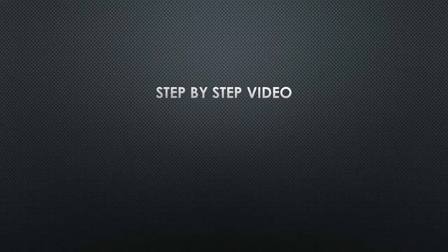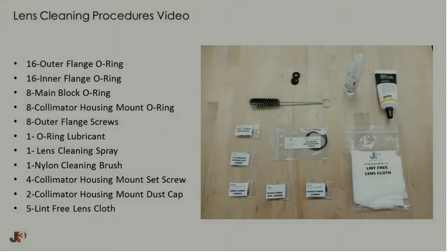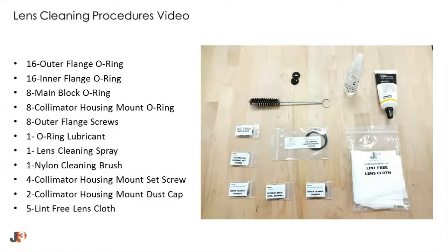Let's take a closer look at the flow cell cleaning process by watching the following video. Not all items in the JP3 lens cleaning kit are necessary for routine cleaning. However, specific items will need to be replaced anytime the flow cell is disassembled.